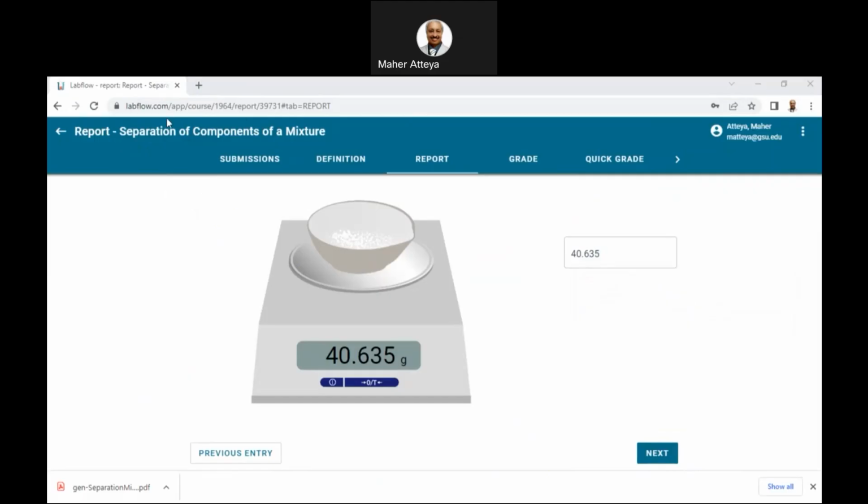So let's repeat it again. Much better. So yeah, that's much better. So this one here, copy, and we are pasting it. So we'll say we did enter the unknown.